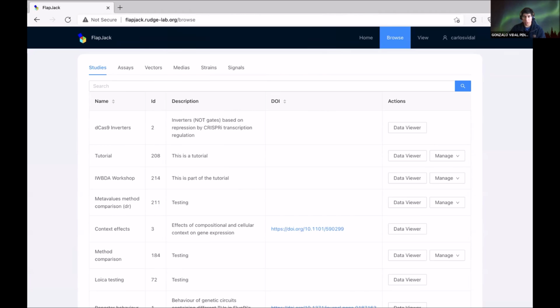Yeah, no problem. Any other doubts, or shall we move to Guille's part? I think we're ready to go with you, Guille. Any other question about the data uploading that we can resolve now?